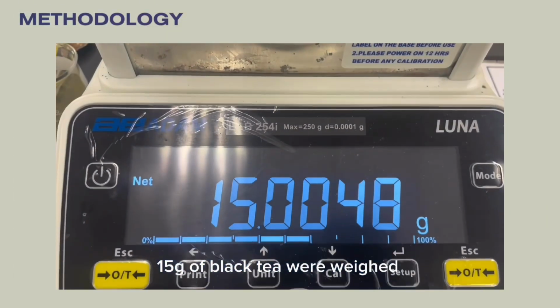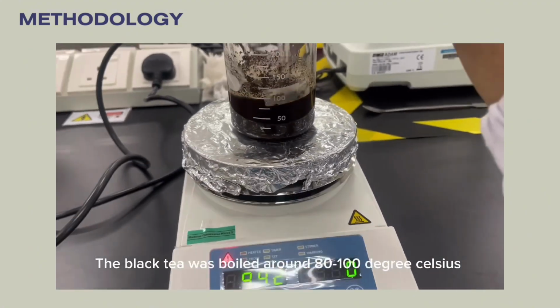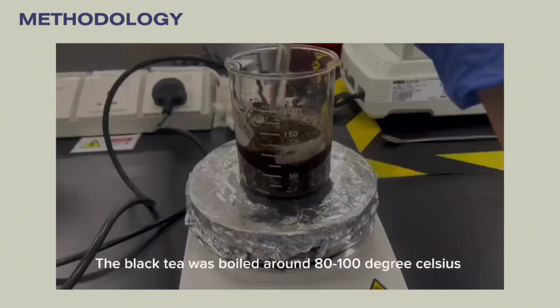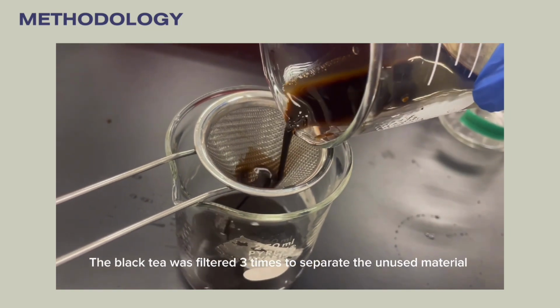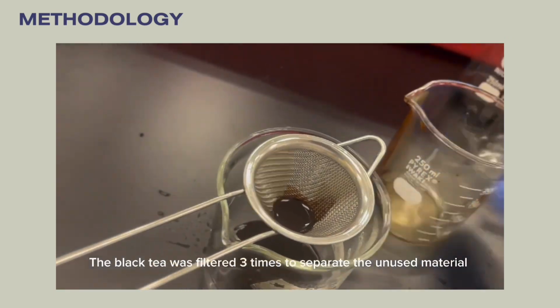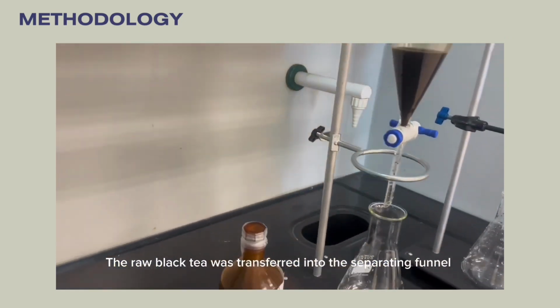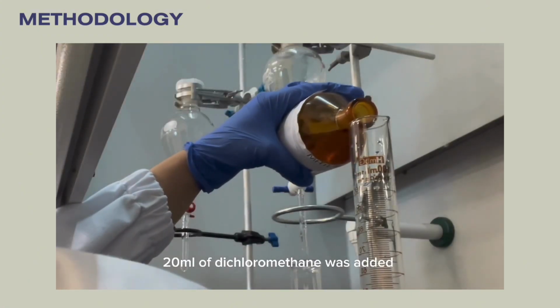15 gram of black tea was weighed and 100 ml of distilled water was added. The black tea was boiled at around 80 to 100 degrees Celsius. The black tea was filtered 3 times to separate the unused material. Then the raw black tea was transferred into the separating funnel. 20 ml of dichloromethane was added.